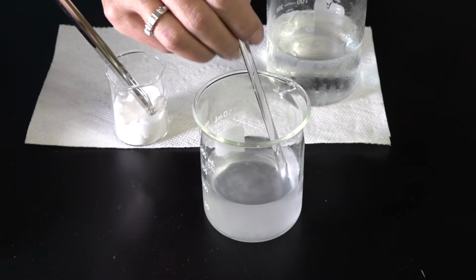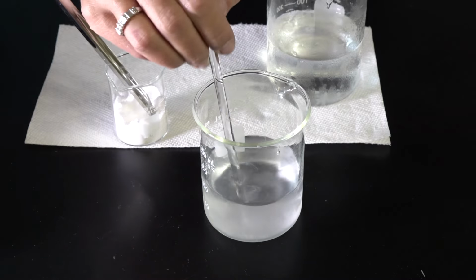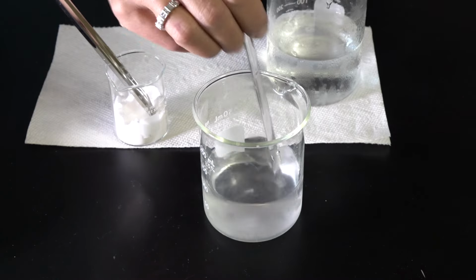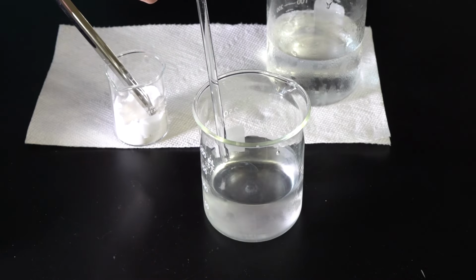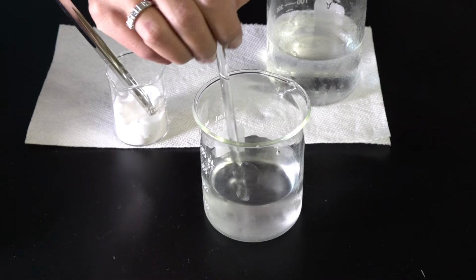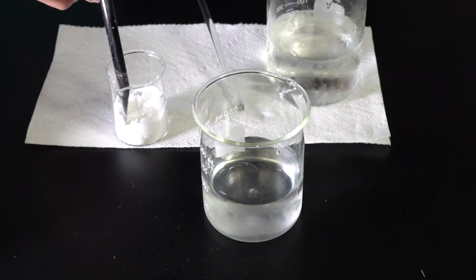I'm getting suspicious that I'm close to the end point because when I stir, it takes longer for the crystals to dissolve. And as described in the procedure, our end point is when we have about as much as the end of your small finger left in the bottom. So I'm not there yet.